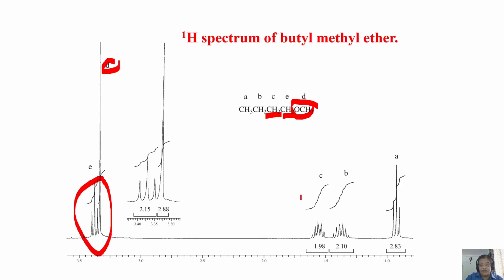What is that possibility? You can see it is only this. Why not this one? See this. You have to carefully observe the complexity. The complexity is much more here. It cannot be a simple triplet of triplets.